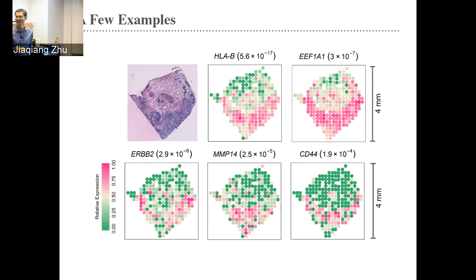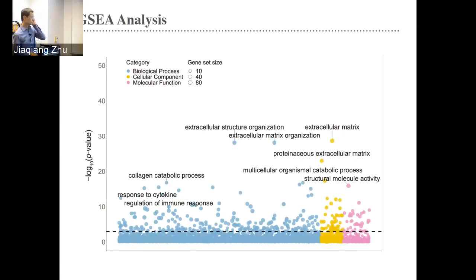It would be interesting to look at what genes are highly associated within those spots. Maybe there are other markers people don't know about, but you are now in the position to identify. Of course. The reason I listed these genes is that they are only identified by our method and not others. And in our paper, we listed about 20 additional genes, for example.